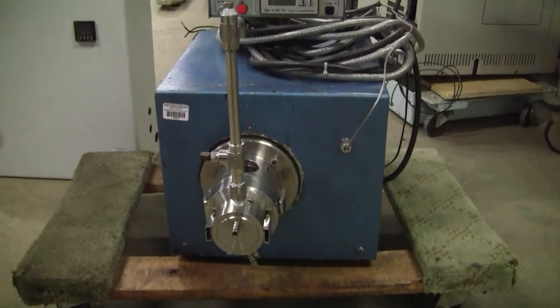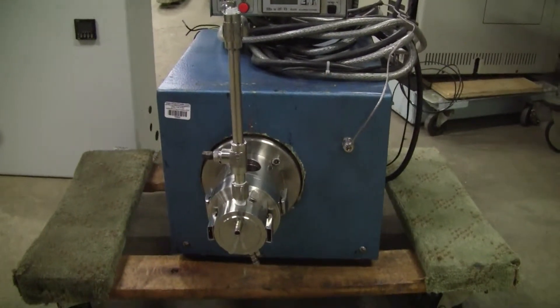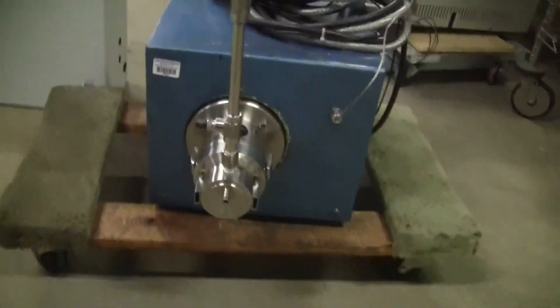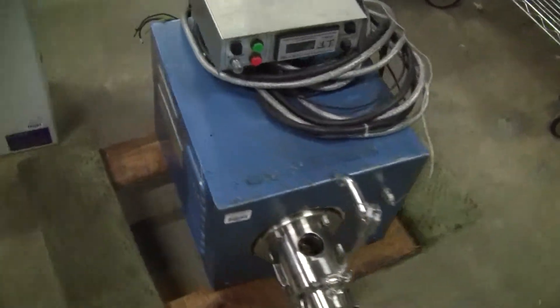It's got a 2-horsepower motor, runs on 230 volts, 5,000 RPMs. It runs off 3-phase. We don't have 3-phase here, so I'm unable to show you it working, but it did come from a working lab.